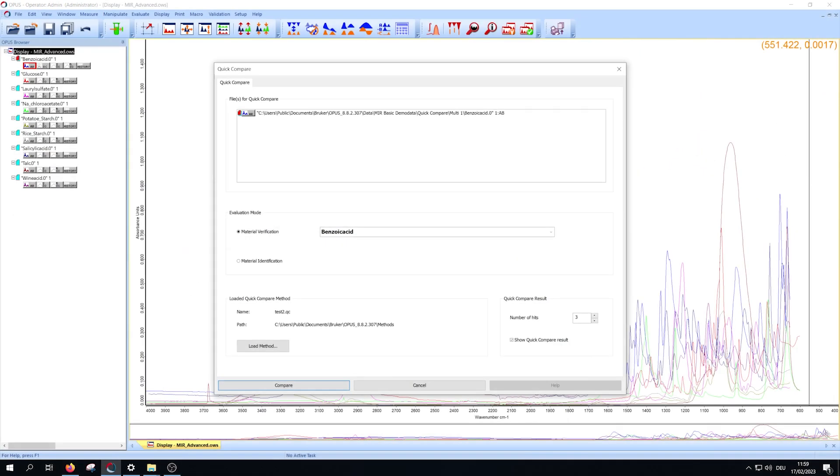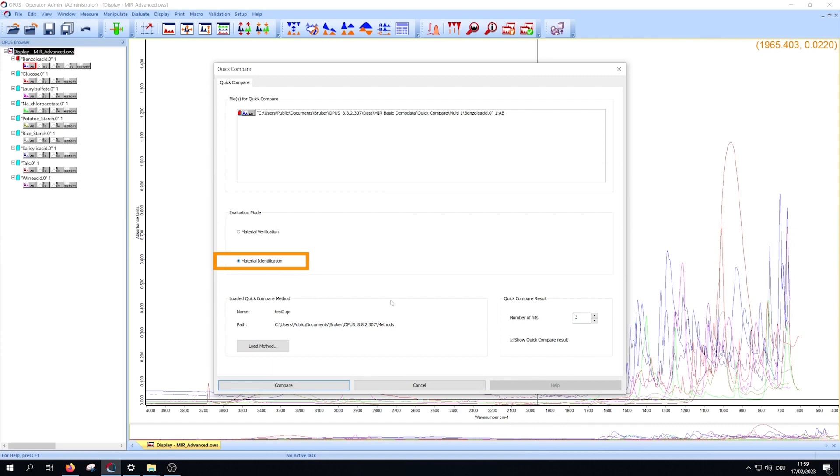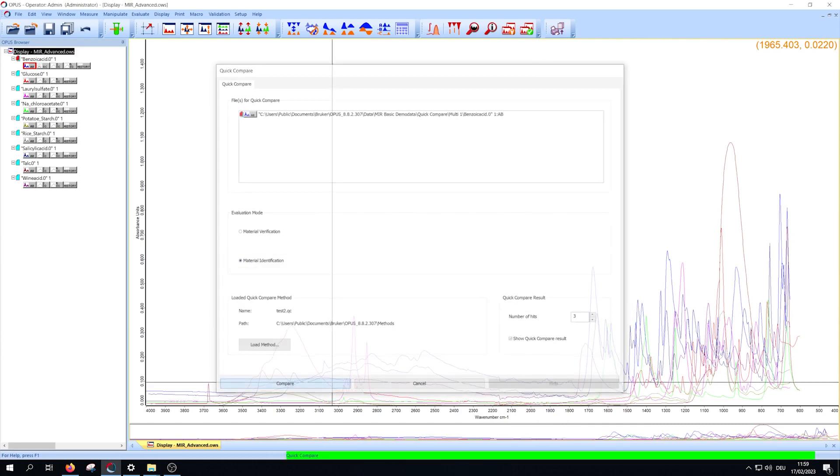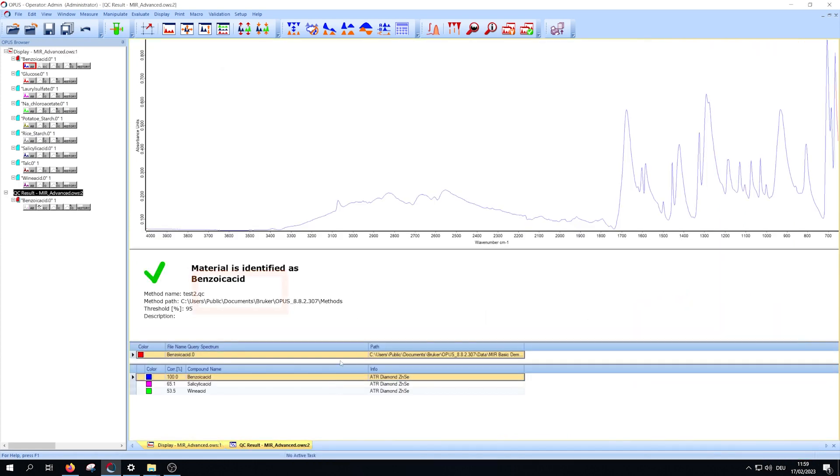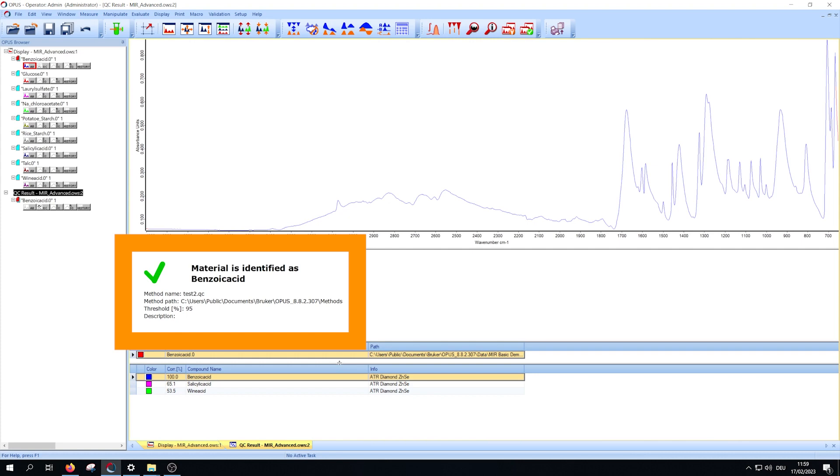If you use identification, you will get the result 'material is identified as.'